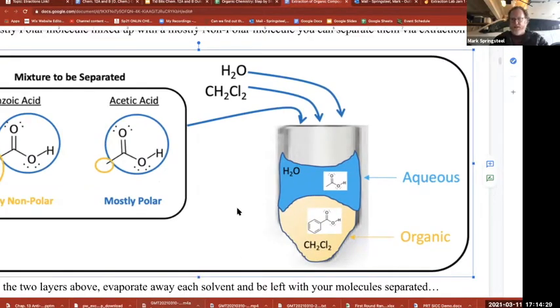All right, good, thanks. Okay, so why is the methylene chloride on the bottom layer? Because it's denser than water. Yep. Does the methylene chloride want to avoid the polar glass and make a bulging upward reverse meniscus? Yes. And the water has a normal meniscus growing up the sides of the glass. Why is that?